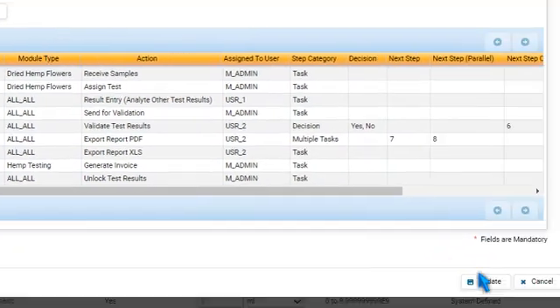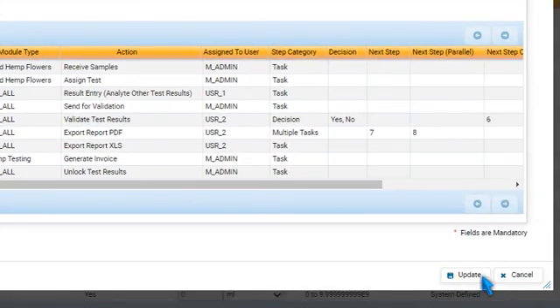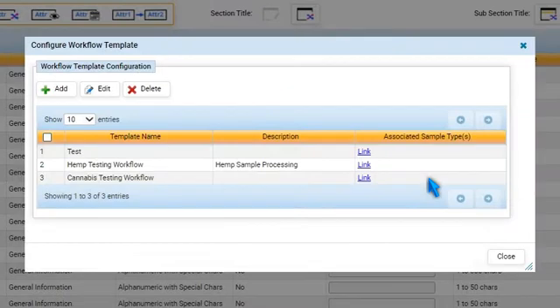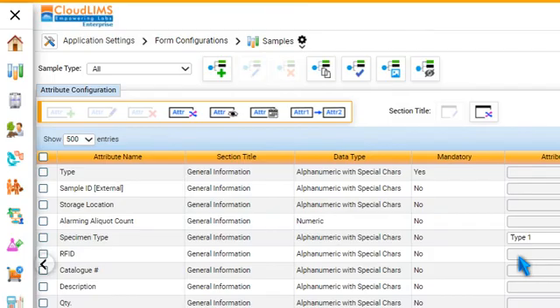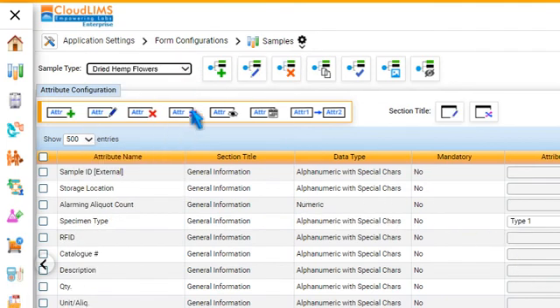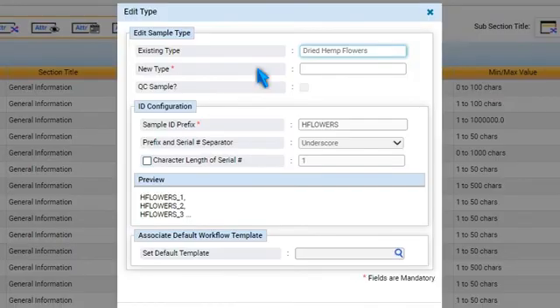Now, press Update to add the workflow template. Press OK, and then Close.